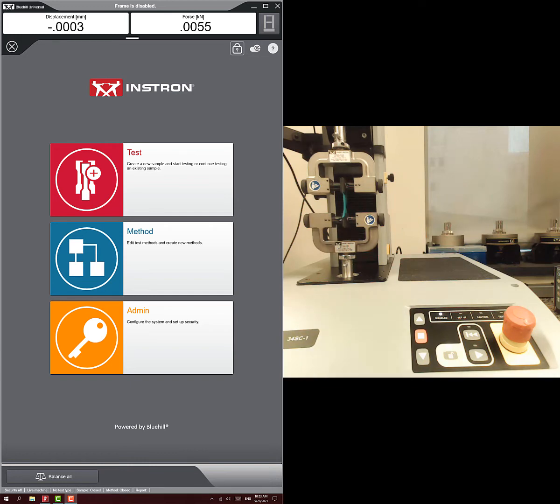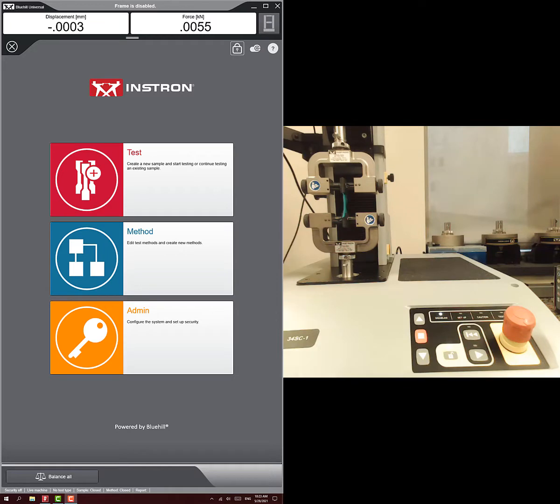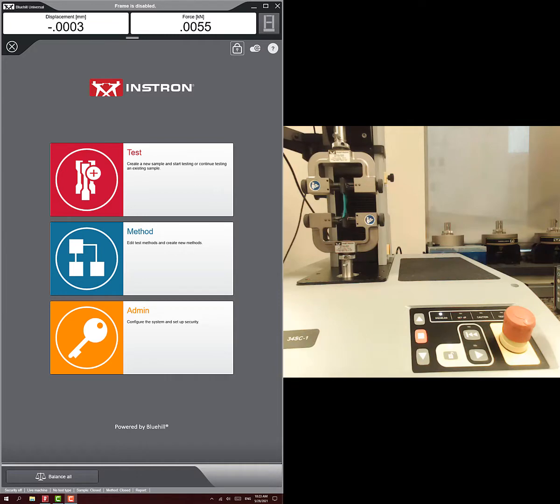Alright, so I showed you guys how to set up a test to do simple tension on this machine. We have a couple more complex tests that we want to do on these tendons, and so I'm going to show you how we can set up some of the more complex tests using this rubber glove example. We want to do both a stress relaxation test and a hysteresis test, and both of those will be a little bit different.